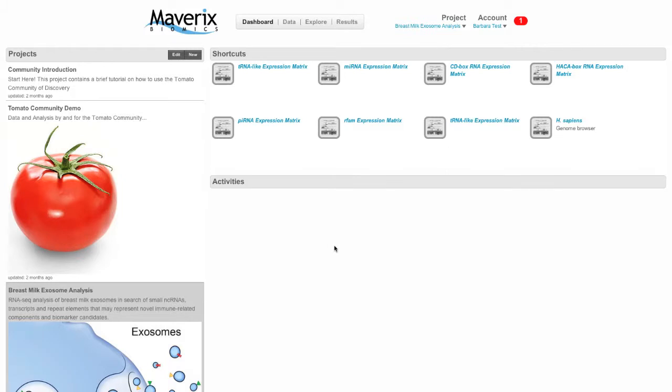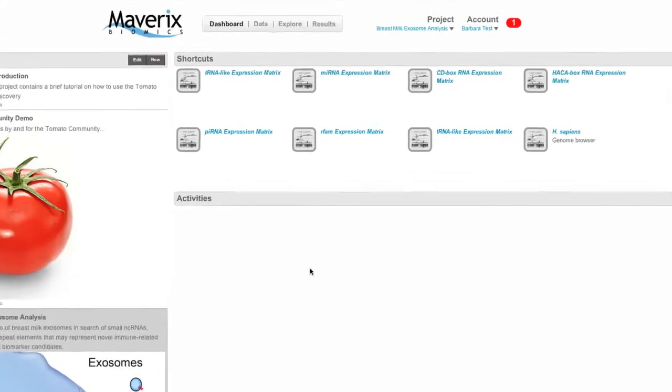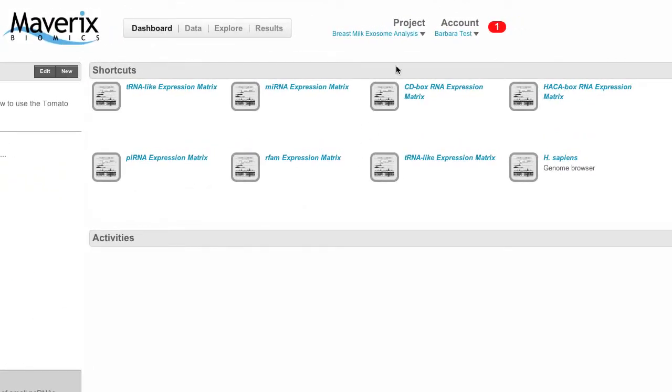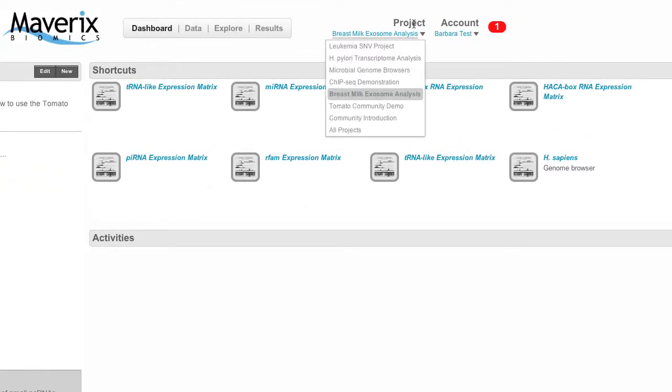This will filter the content displayed in the shortcuts and activities section on the right. When you're on a page within the platform other than the dashboard, you can move easily between projects by hovering over 'Project' at the top right and selecting a specific project.